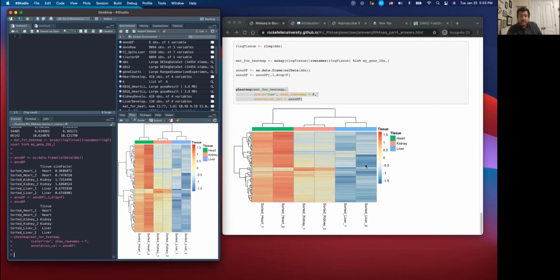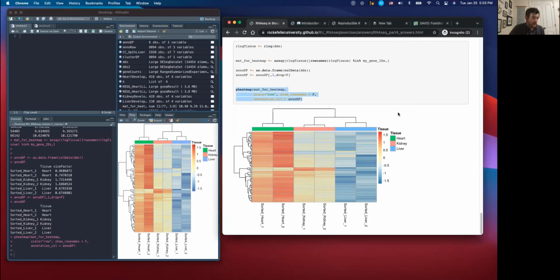Now you can actually see all of these genes together. And so often this is a nice counterpart to a gene set analysis for the few gene sets you really care about. And it's interesting, there's one set that's actually more significant to kidney. Just a few in the middle. But yeah, so that is it.